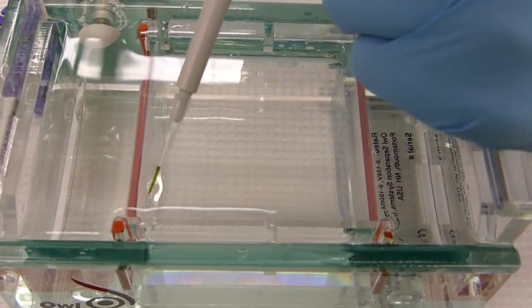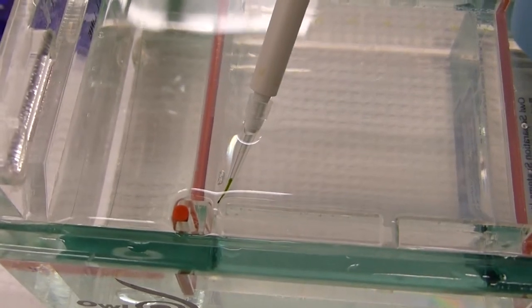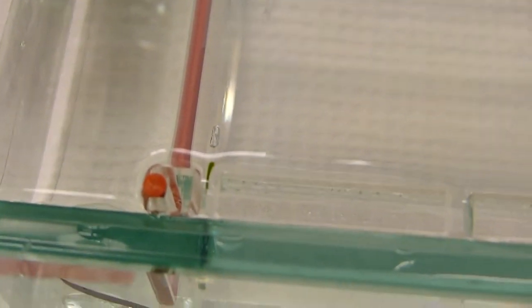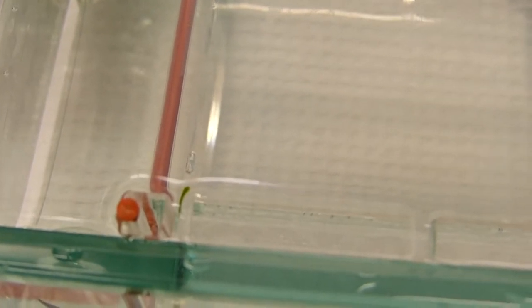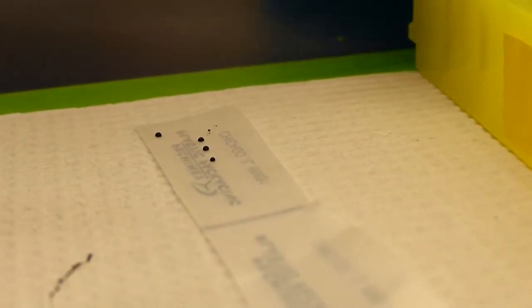You will want to take your loading dye and carefully put it into the first slot in the gel. You can take it, put it down in the slot carefully and eject it. Be careful not to puncture the gel as this will cause problems with your running and you will not get accurate results. But be careful also to make sure that you are in the slot when you eject it or else the dye will just go everywhere.